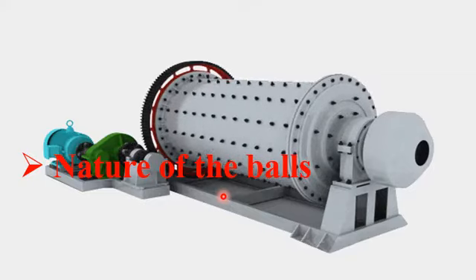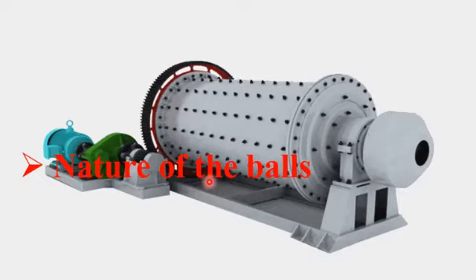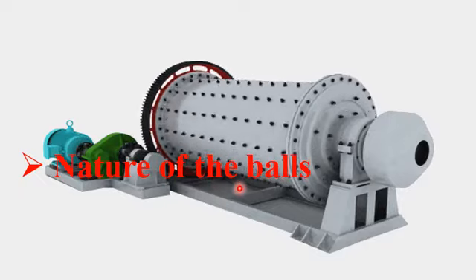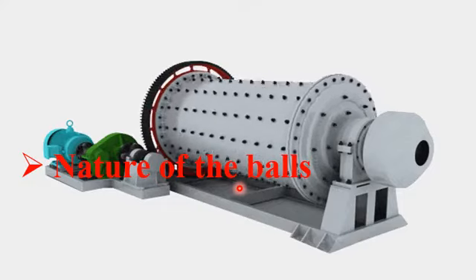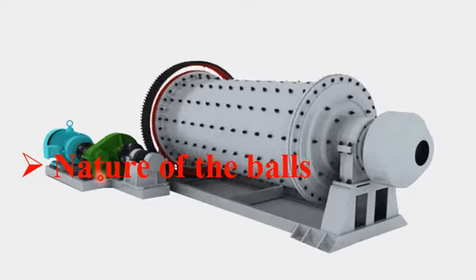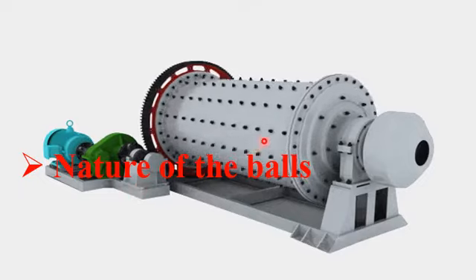Please note that, as I have previously discussed, the ball mill instrument consists of a hollow cylinder which is known as a drum. The bulk material in the form of powder is incorporated inside this drum.